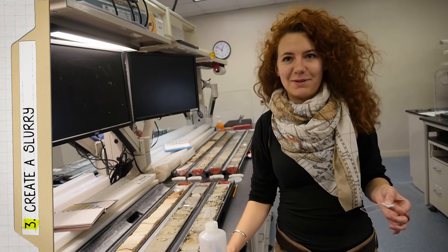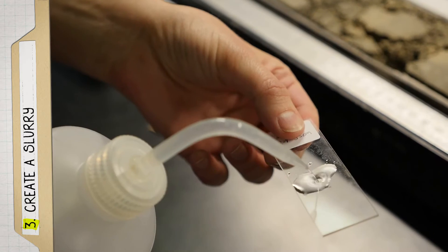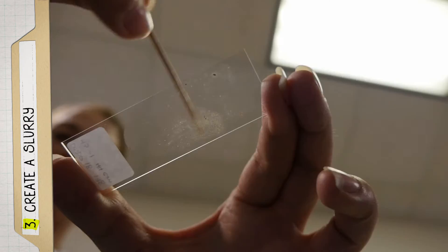Now that you have the sediment on your slide, you dilute it with water and disperse it with a toothpick so it's really even on your slide.